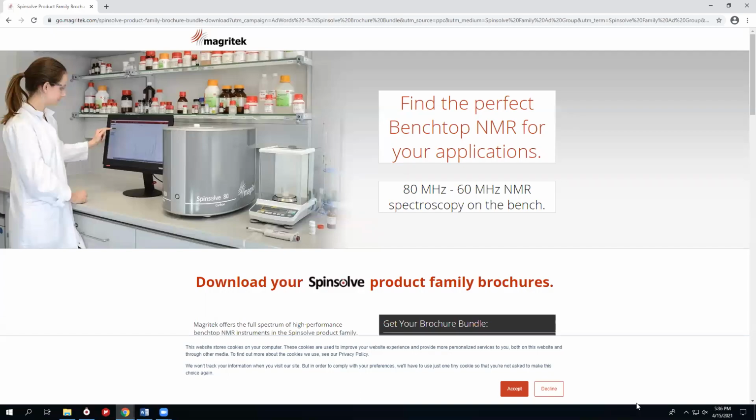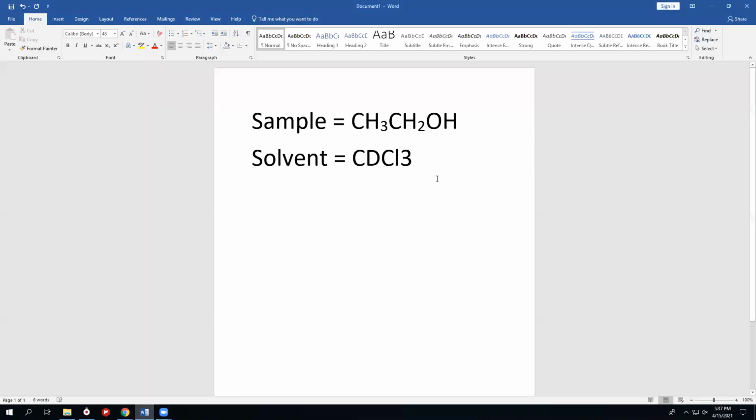Hello class. In this video, we are going to learn how to use our benchtop NMR to collect proton and carbon signals and how to process your data. So the sample we are going to use today is ethanol, CH3CH2OH. The solvent for ethanol is deuterated chloroform, CDCl3.